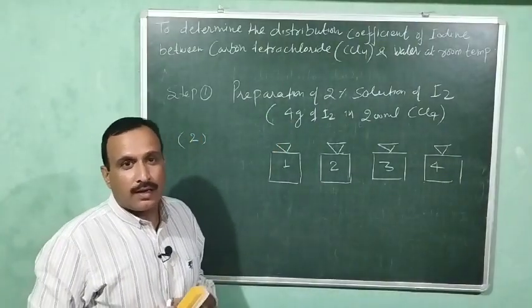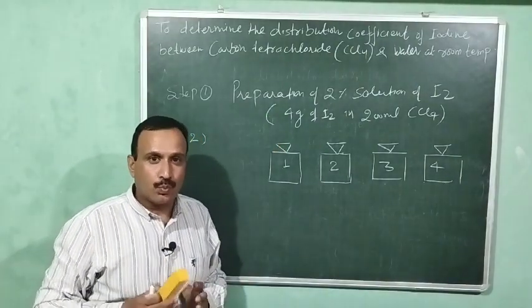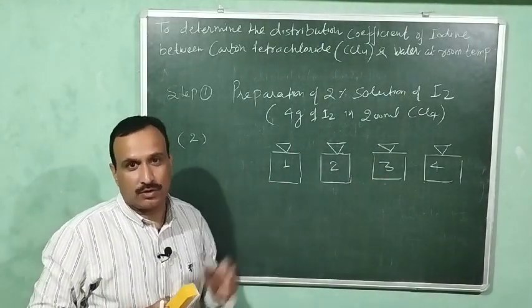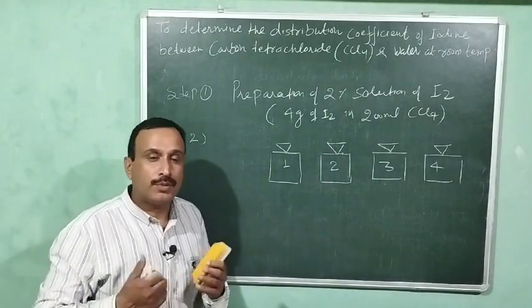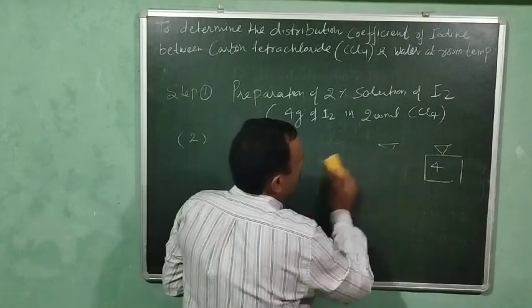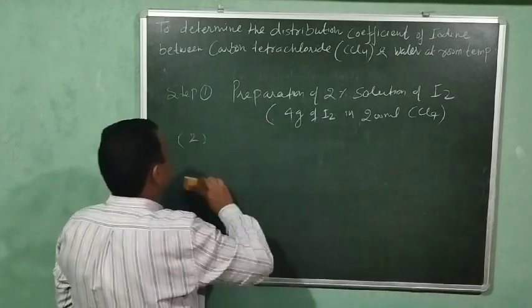Okay, and in the next step of the procedure, we will prepare solutions in these reagent bottles, and the procedure will be explained with the help of a table.